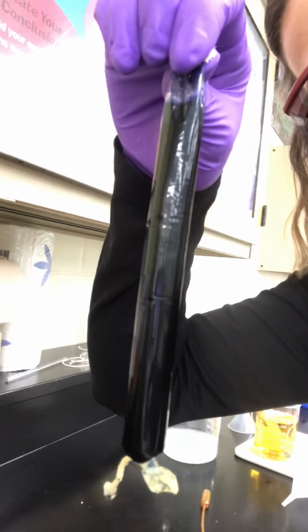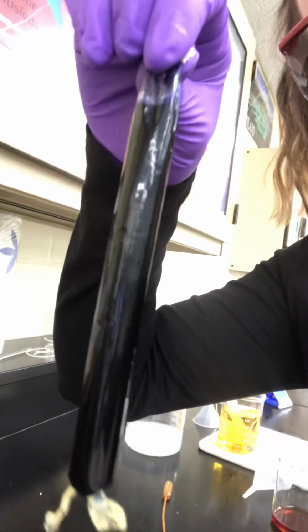Also, why does the starch not get out of the bag? Well, we know starch is a macromolecule. It's really large, so it is too big to diffuse out of the bag. And in your lab, there's that pre-question that's an analogy, like how is a cell membrane kind of like a window screen? It's kind of like a window screen because air can move through a screen, but large things like a housefly cannot. Well, the same thing here. This bag is made up of tiny little pores, so the water and iodine solution can diffuse through the bag, but the large starch molecules cannot.